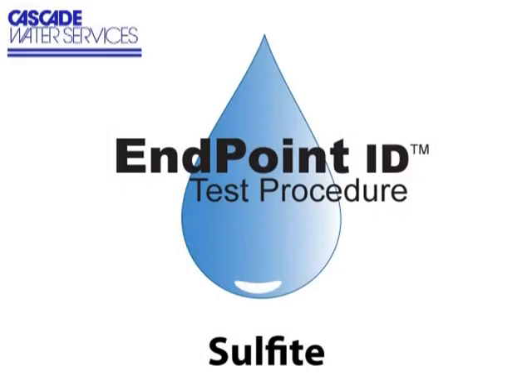This is a demonstration of a sulfite drop count test kit using endpoint ID procedures.